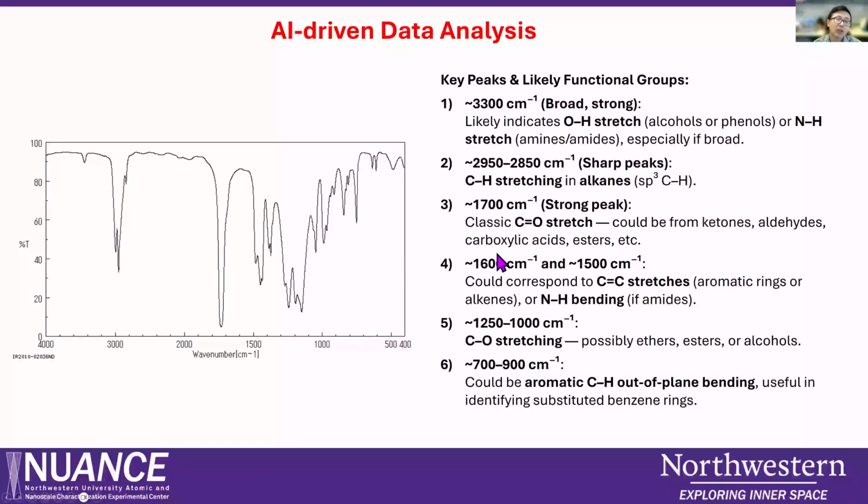I think it is not 100% accurate, but it is a very good starting point and gives you a lot of information. Based on this, you have to identify what is correct and what may not be accurate. I think using this AI tool is very helpful.